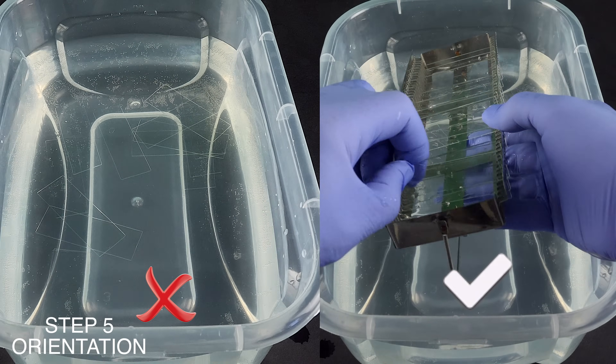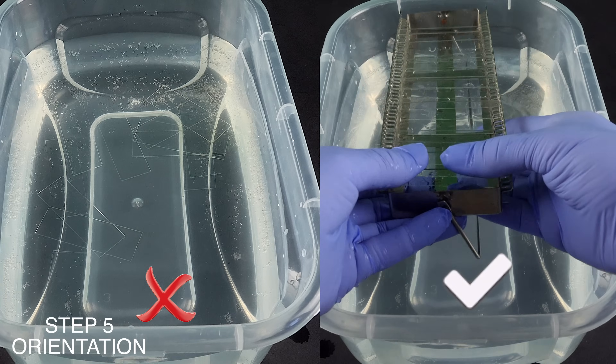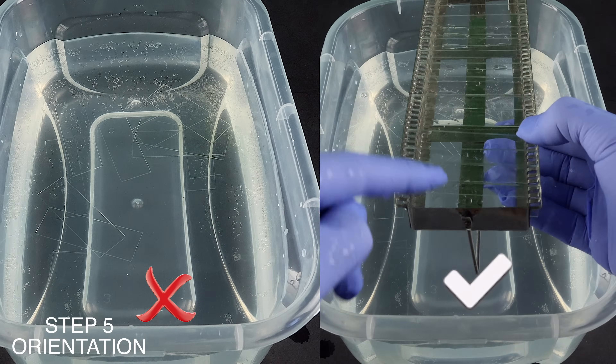Also, rotate parts to release air from blind holes. Then wrap to prevent holding liquid between surfaces.